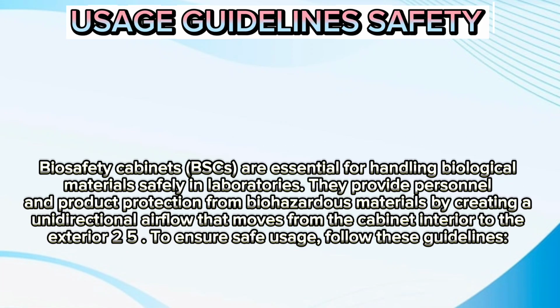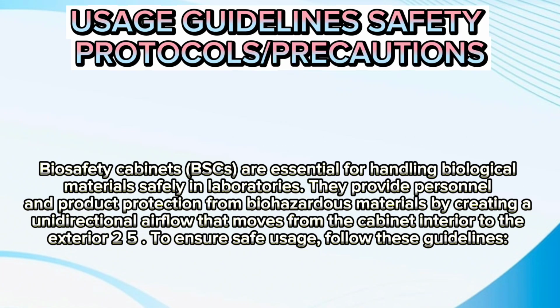Biosafety cabinets, or BSCs, are essential for handling biological materials safely in laboratories. They provide personnel and product protection from biohazardous materials by creating a unidirectional airflow that moves from the cabinet interior to the exterior. To ensure safe usage, follow these guidelines.